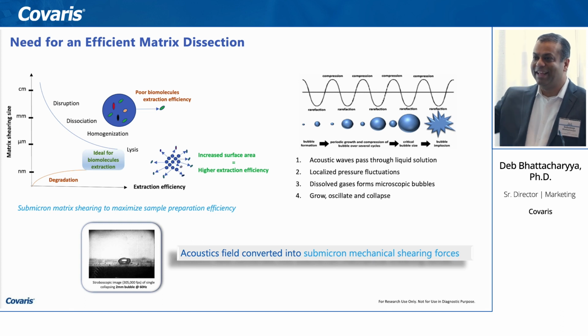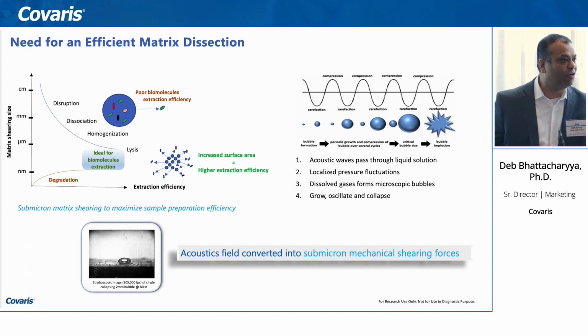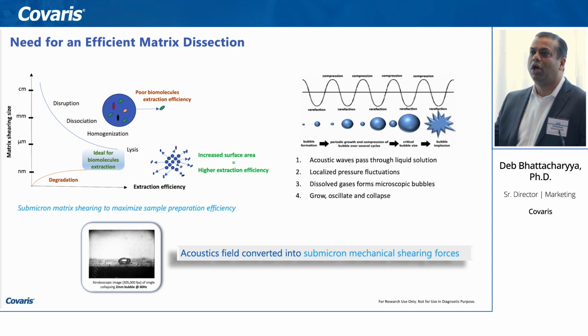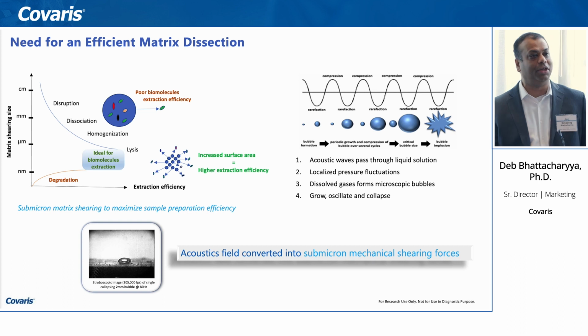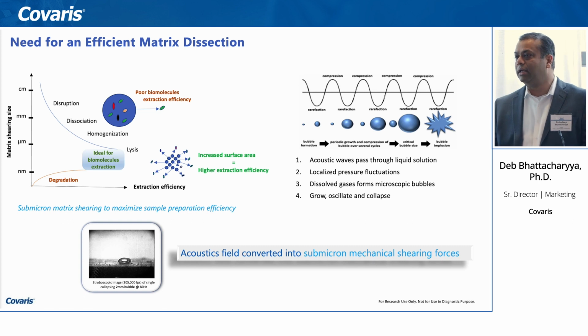And the sample is sitting in a buffer, which we all provide, because it's in the form of tissues, it's in the form of cell lysates, that's in a 96 well plate or a single vial or an 8-strip format, where you create a lot of these cavitation bubbles because of the energy hitting the sample, which in turn coalesces, implodes, releasing an energy that causes samples to disrupt, shear. So that's essentially the first step when you start with tissues, cells. That's where you start the game, because you want to extract as much protein as possible.